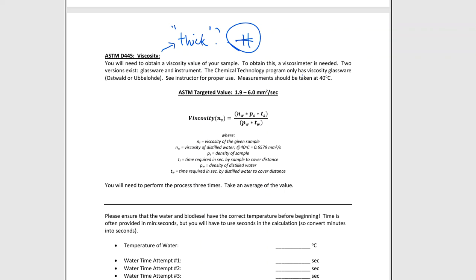All right, so what happens in a viscosity test? Well, first off, you can use what we call a viscometer to do the test. This involves injecting the liquid onto a machine, almost like a density meter, and then allowing the instrument to do what it needs to do, and it will give you an answer on the viscosity of that liquid solution. That is not a big deal, but the problem is, we don't have one. So in the meantime, we've got to go a little bit more old school, like how they used to do it back in the day.